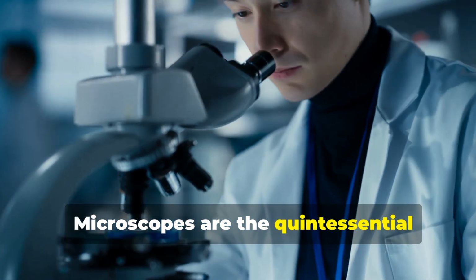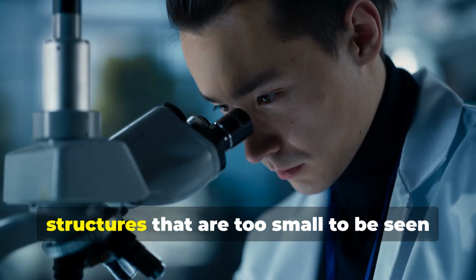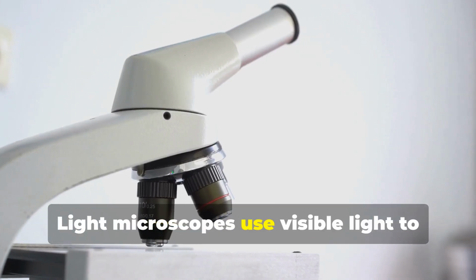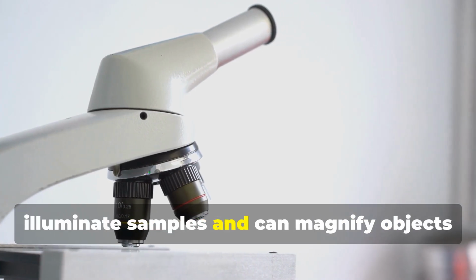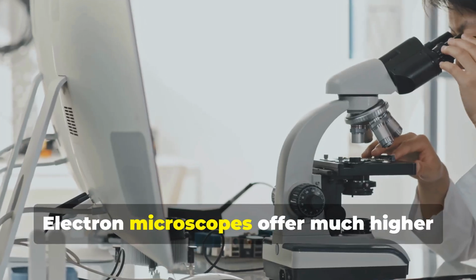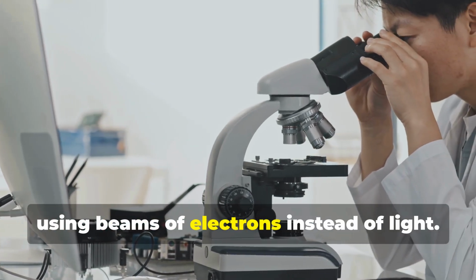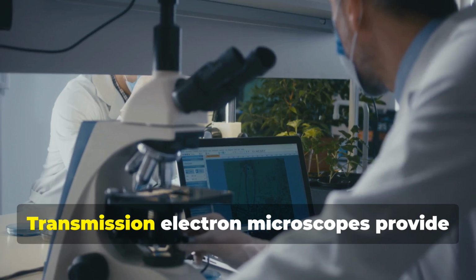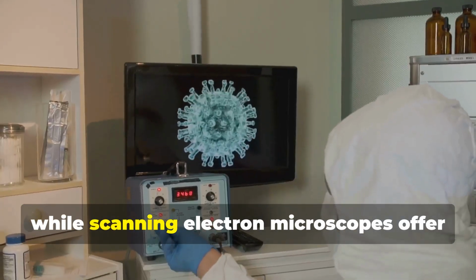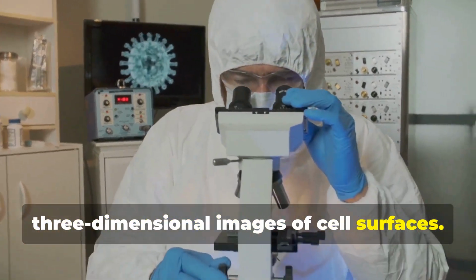Microscopes are the quintessential tools for cell observation, allowing scientists to visualize structures that are too small to be seen with the naked eye. Light microscopes use visible light to illuminate samples and can magnify objects up to 1,000 times. Electron microscopes offer much higher magnification and resolution, using beams of electrons instead of light. Transmission electron microscopes provide detailed internal views of cells, while scanning electron microscopes offer three-dimensional images of cell surfaces.